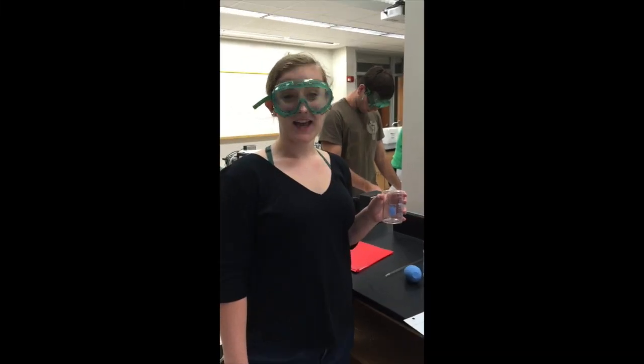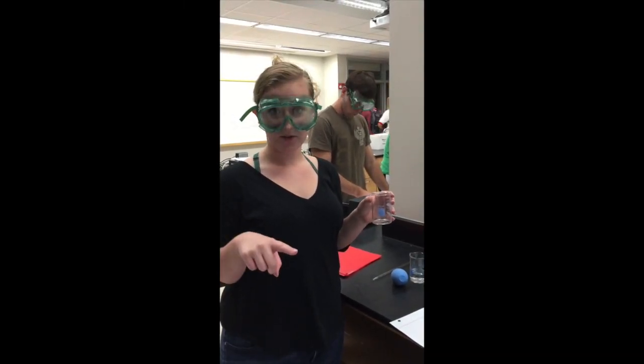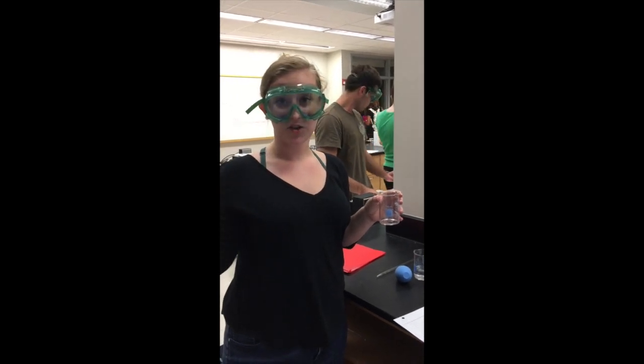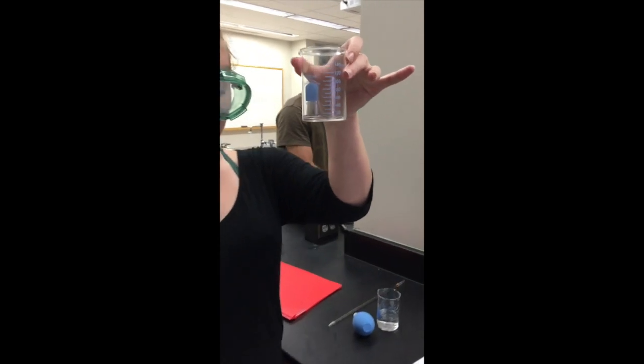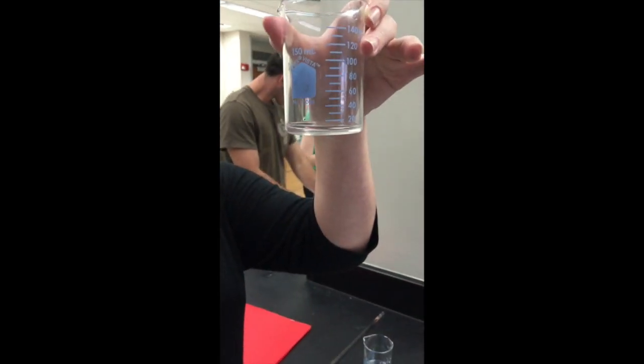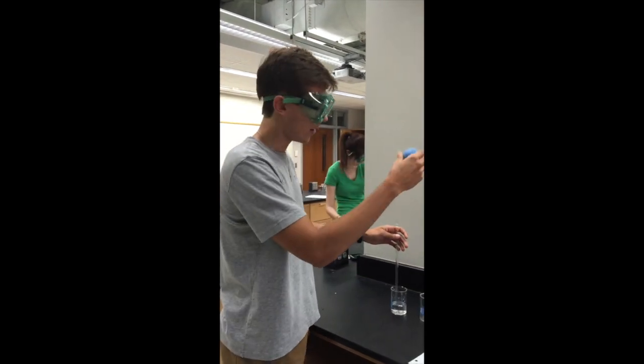1.09. So, now that you've found your final volume and your initial volume, you take the final and subtract the initial from it, thus creating your actual amount delivered. Mine was about 3.20 milliliters. And we're going to show 3 more examples of how to do this properly. So first the bulb.